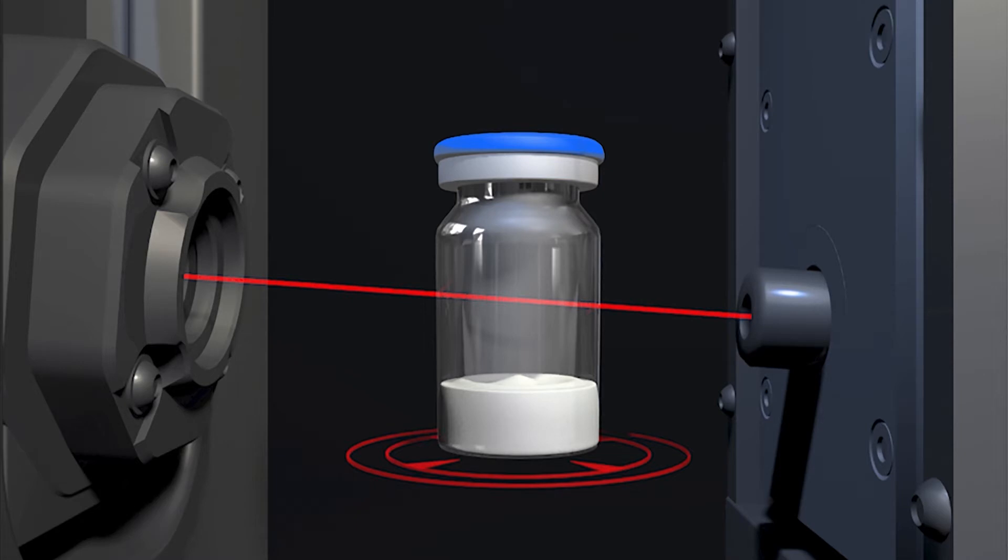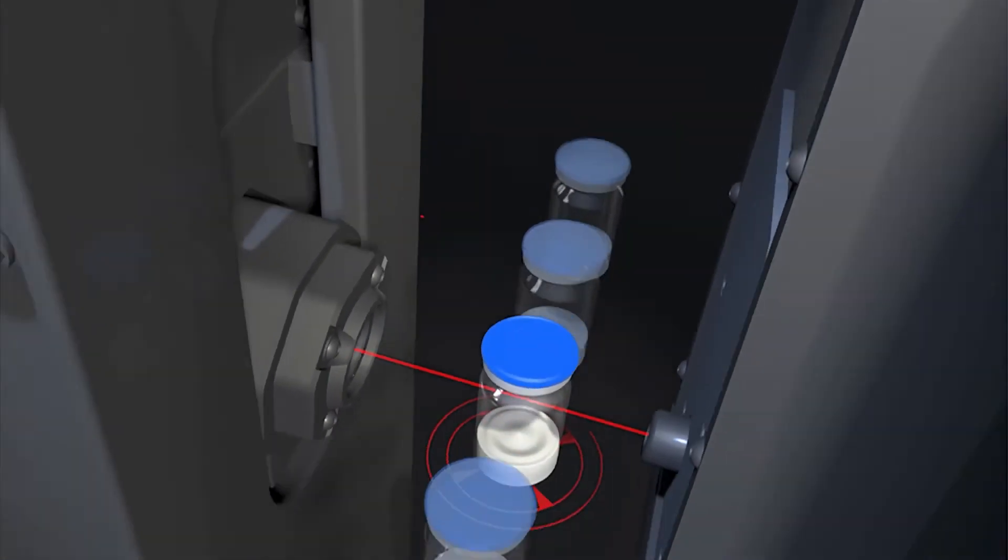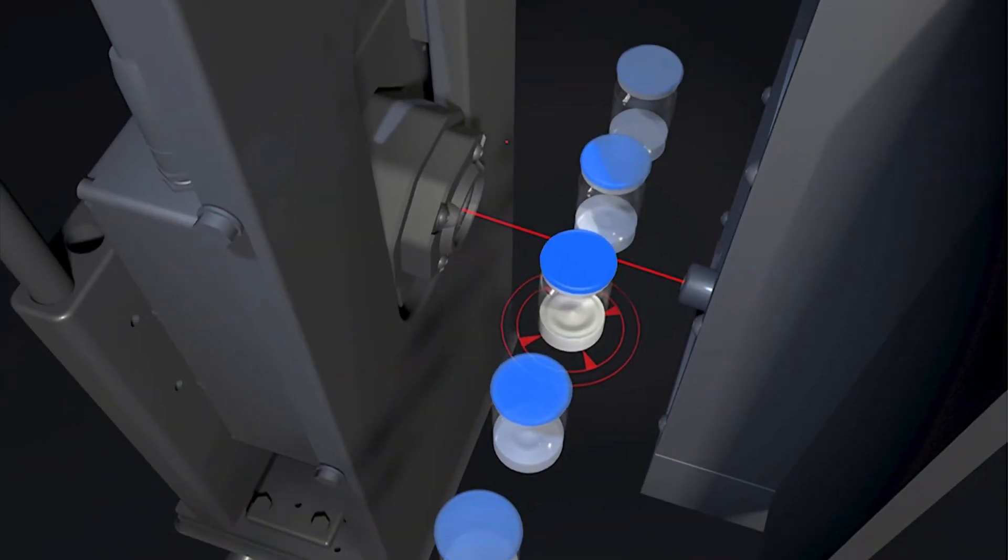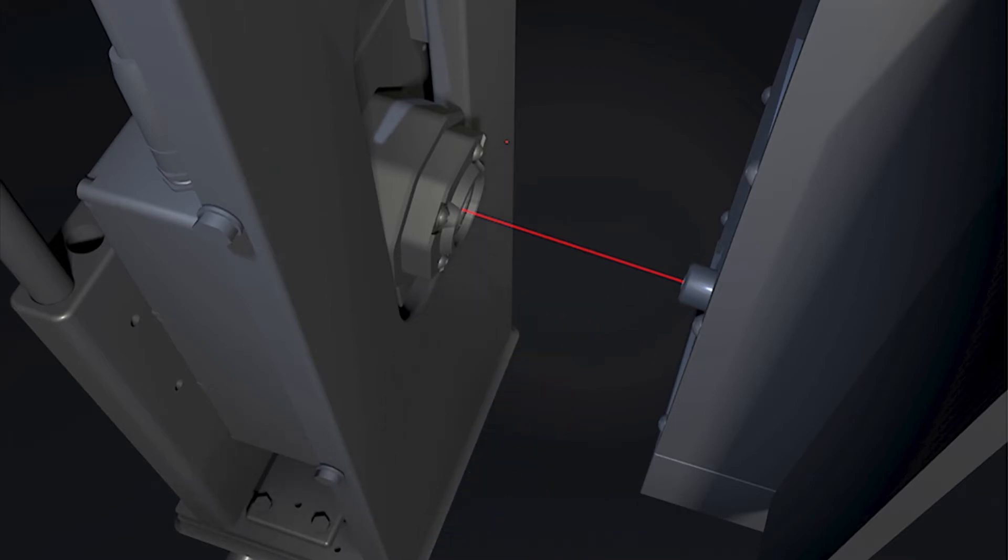The high-performance processor now analyzes the data acquired by the sensor. If a vial is found to be defective, it is automatically rejected.